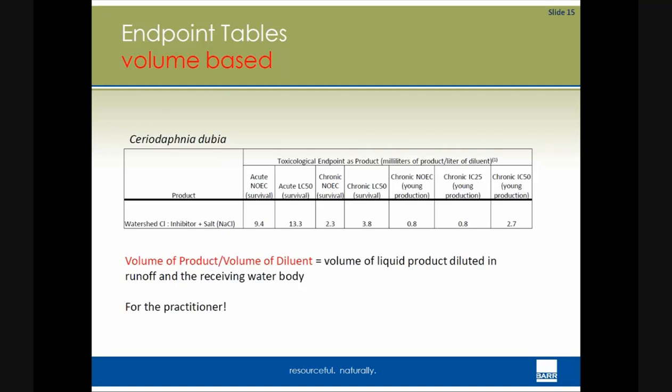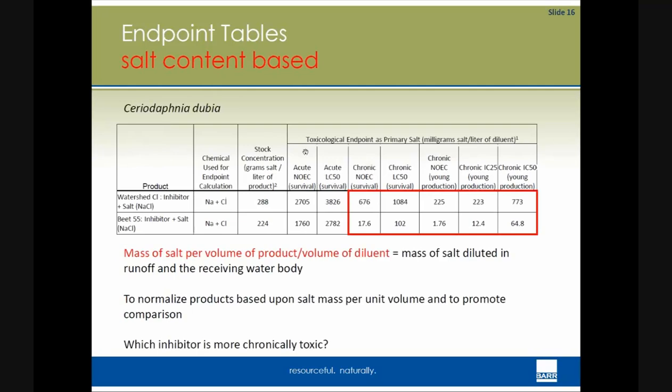And Keith, this is Ron again jumping in, and some of this is how we had Keith look at this project. On slide 16, Keith, if you could go back to it, that was looking at the Ceriodaphnia dubia. The way we tried to approach this was to look at the cause and effect of the minnows, the dubia, and the algae, and roll that into a method for a relative toxicity ranking.